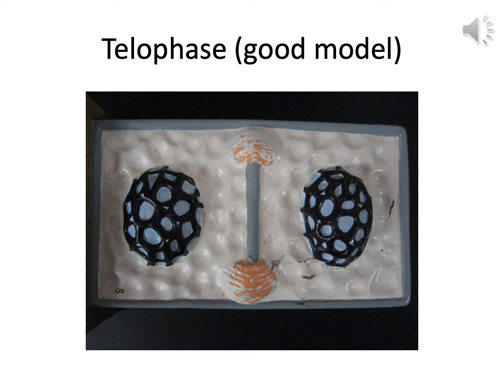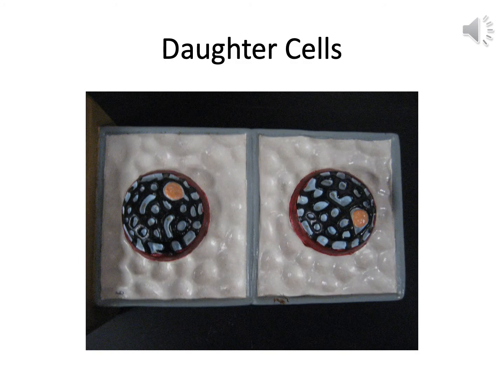I still find it interesting that the animal cells will pinch inward until you get 2 cells, whereas the plant cells will kind of grow from the inside out. They're kind of opposite that way, but it works. Like the daughter cells of animal cells, the daughter cells on plants are identical cells that are about half the size of the mother cell. They've still got an identical number of chromosomes as the original cell had, and each individual chromosome is identical to what the mother's chromosome had.